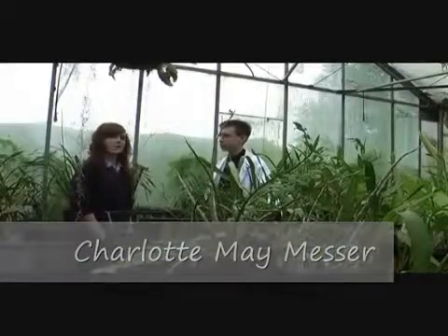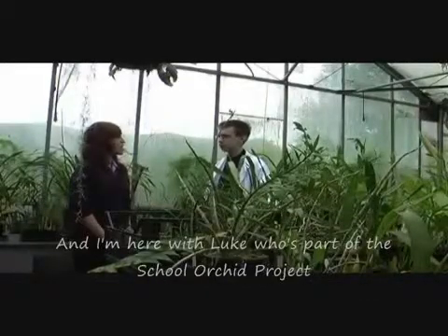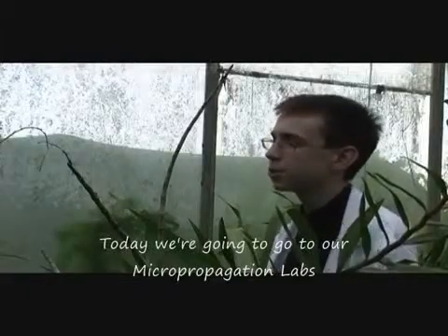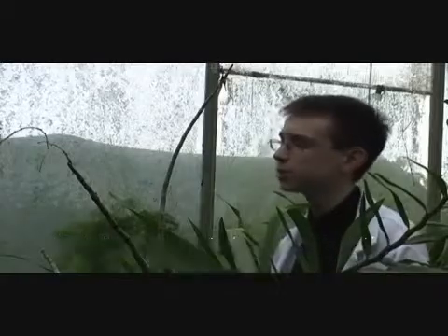Hello, I'm here at Reuton School inside one of the main greenhouses, and I'm here with Luke who is part of the Reuton School orchid project. So what are we actually going to be doing? Well today we're going to go up to the microprop labs and use our microprop facilities to show you our techniques of replating orchid seedlings.